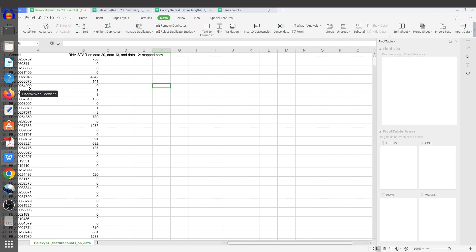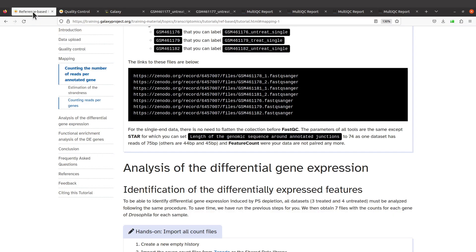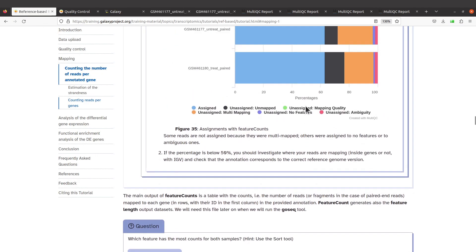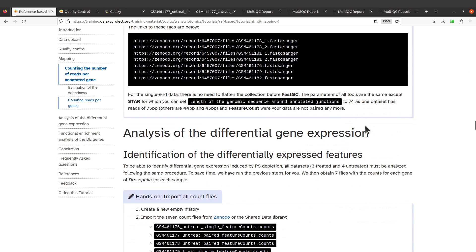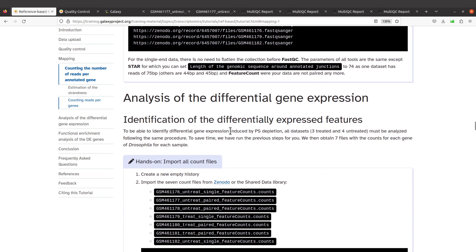After generating your counts data, what you can do next is perform differential gene expression analysis. Tools like edgeR and DESeq2 can be used for this. This tutorial uses DESeq2, and I've covered tutorials on that — both the command line version and the Galaxy version — so you can choose whichever you prefer. Check the description box for the links to those videos.